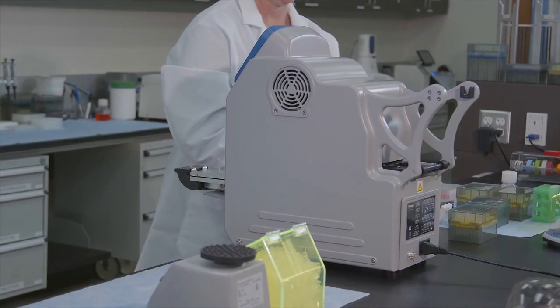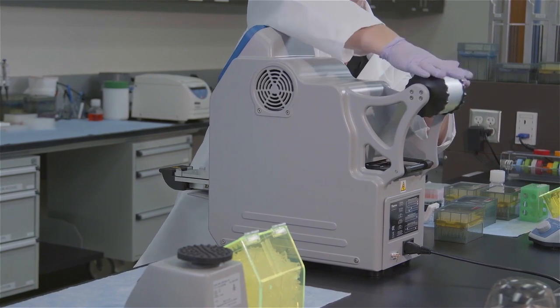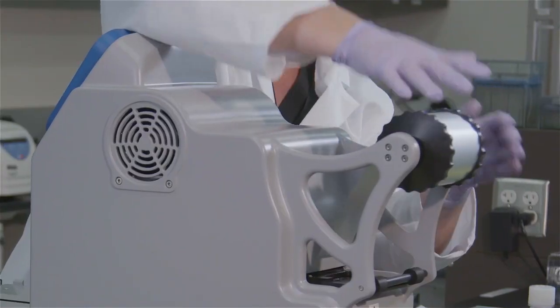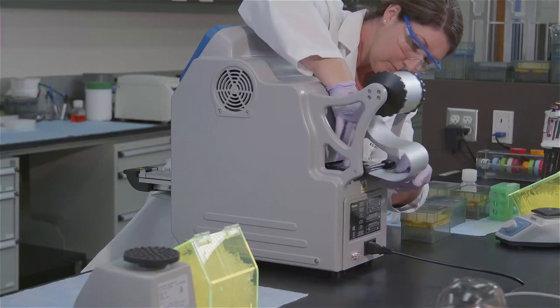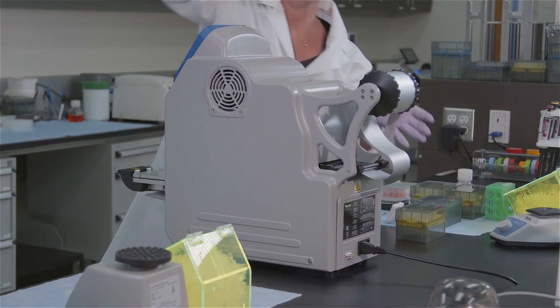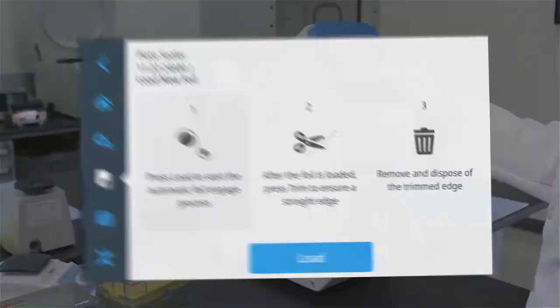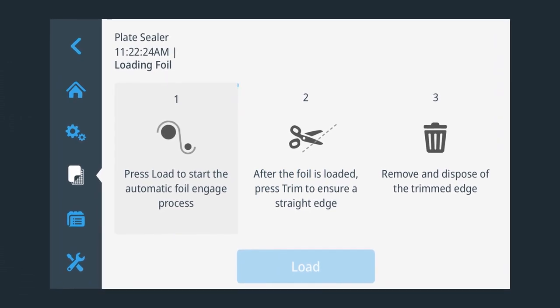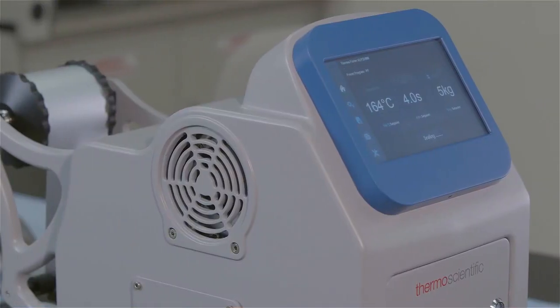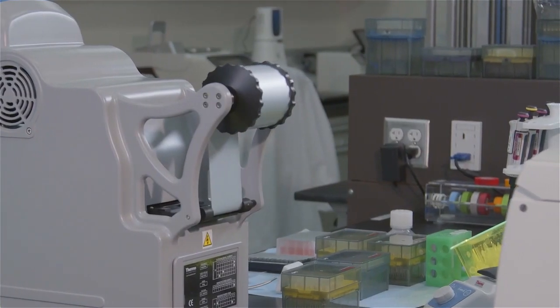To load the foil on the automated plate sealer, you'll first need to place the foil on the spool on the back of the unit. Allow one turn of the roll to provide enough slack. Loop the foil under the bar and into the feed slot. Tap the foil load icon on the main screen and follow instructions. The unit will now automatically feed the foil into the system until the internal sensors are reached.